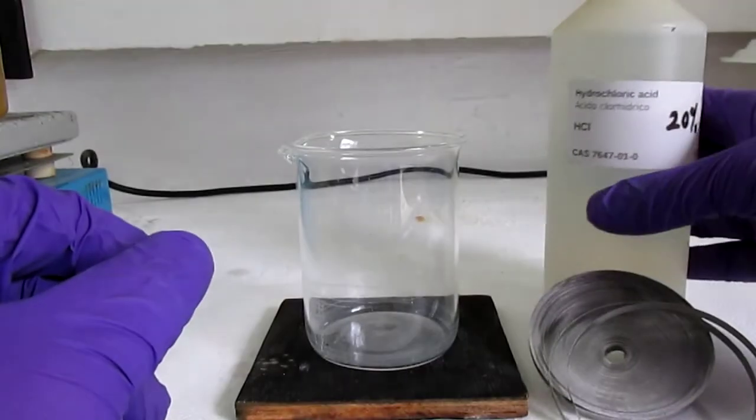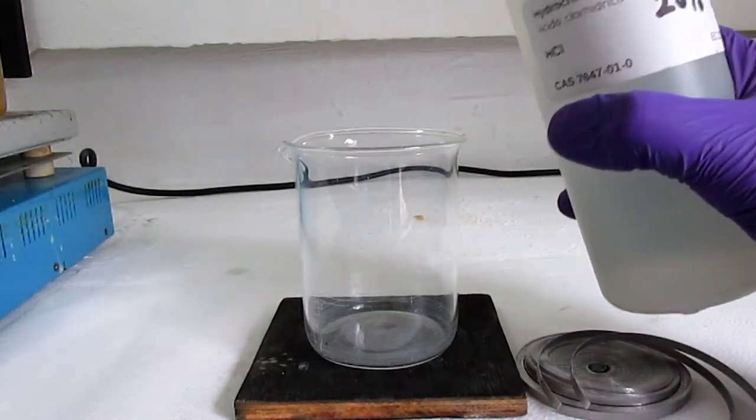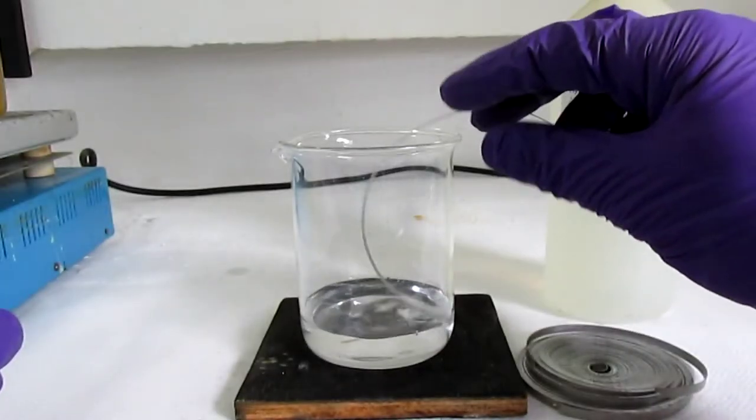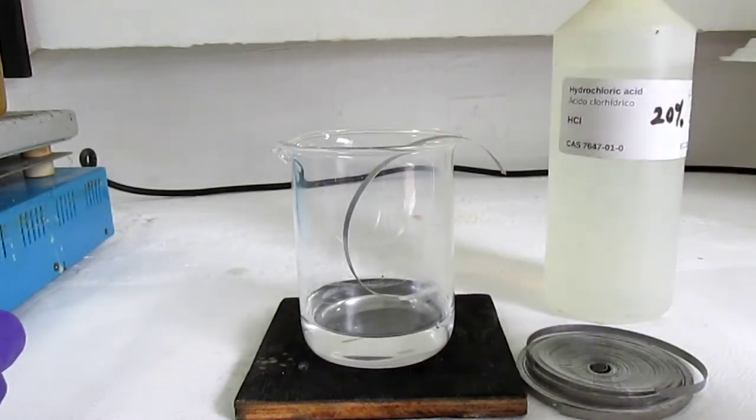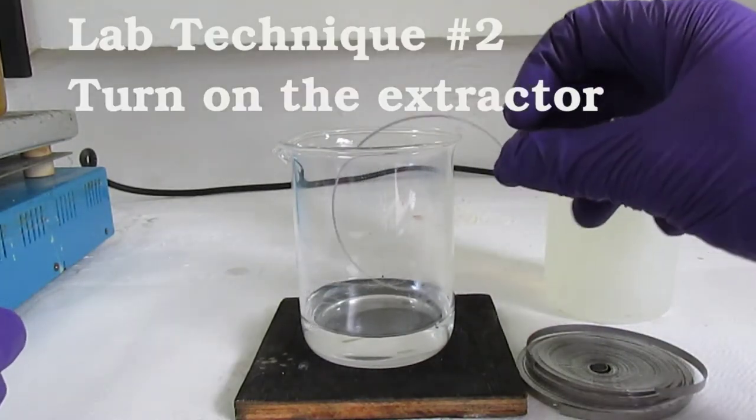To start with, I just put about 50ml of 20% hydrochloric acid into a 250ml beaker and then started adding short lengths of magnesium metal, in this case some ribbon.